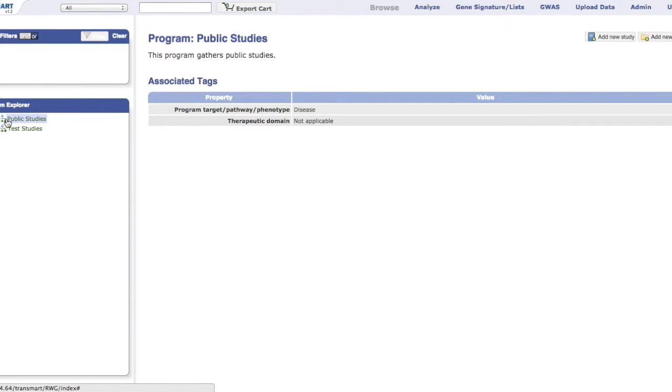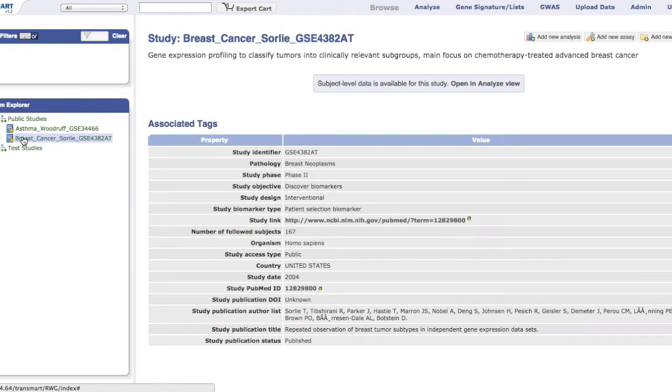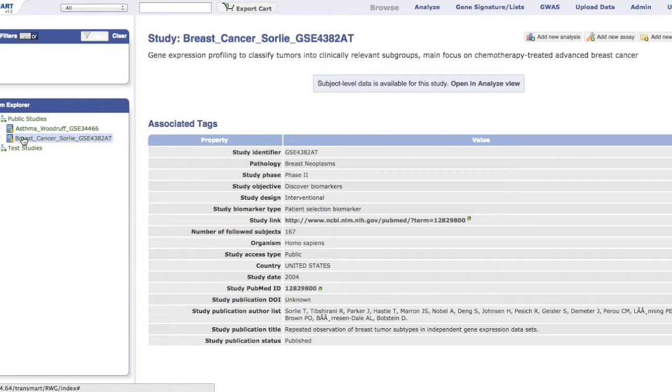For example, one of the studies listed is the breast cancer study. By clicking on this study, its information, known as metadata tags, are shown on the main display.